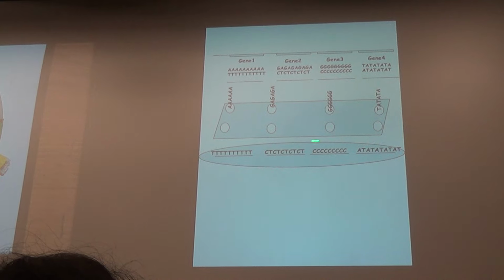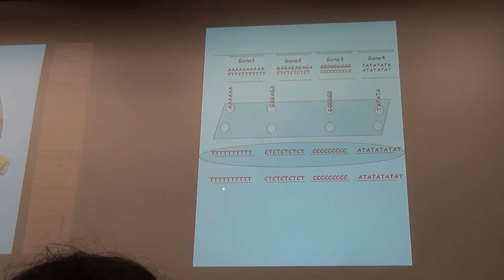So you're going to isolate RNA from a cell. You're going to label it with a fluorescent dye. And now you're going to take this labeled RNA and you're going to anneal it onto the microarray. And it's not really RNA that's labeled, it's the cDNA that's labeled. So you made a complementary copy of the RNA, and that complementary copy is what is labeled. But it doesn't matter. Assume that all of the RNA is labeled. This RNA is now added to the slide, and it will hybridize.